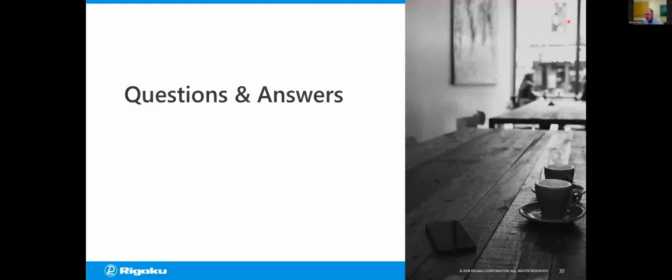We've done many tests with LOQs down to 0.1%. And if you're willing to collect data for a longer time, then you can probably push it much further beyond that as well. In the end, it comes down to how long you want to wait to collect the data. Okay. All right.